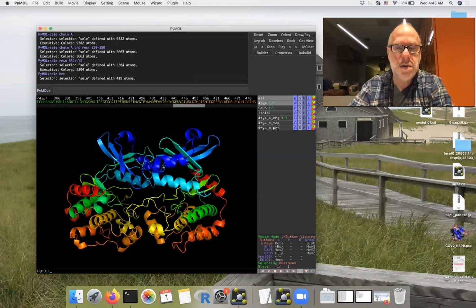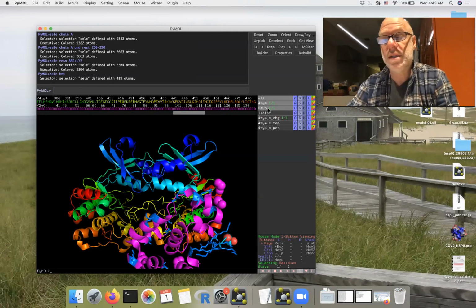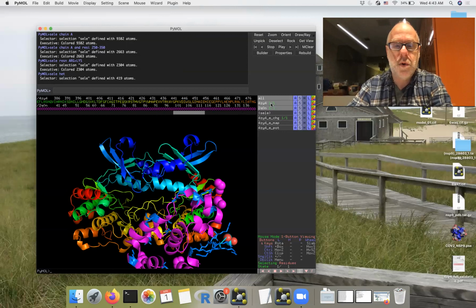One thing I want to show you how to do is how to align two structures. And so remember, 2Q0N is hiding over here someplace. It's a structure of the same protein, PAC1 kinase. And so what I want to do is align it to 4ZY4. There's two ways to do that.